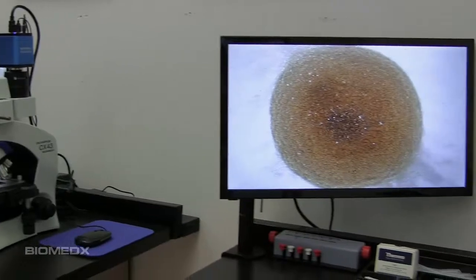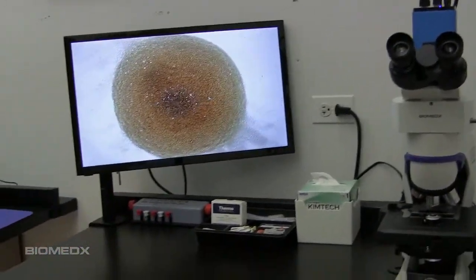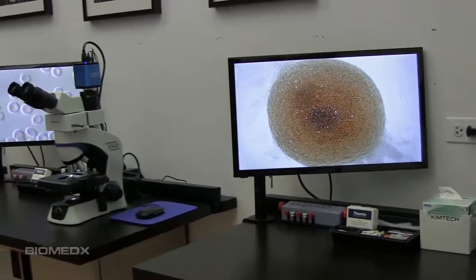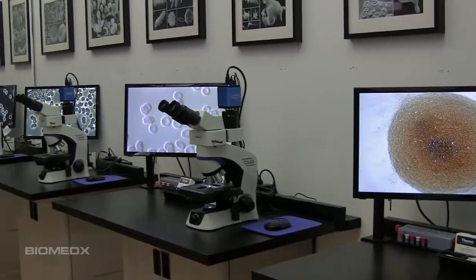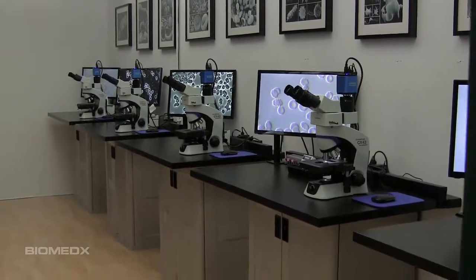This last image, this is bright field. Again, this is looking at a clot retraction dry blood layer in the bright field mode. So that's a quick intro to the scopes. We'll get into more in the other videos.